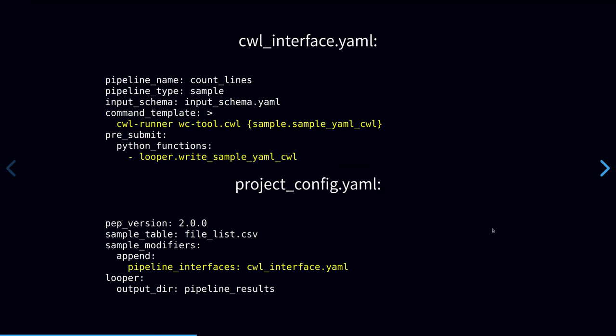To connect Looper to CWL, we simply specify the CWL runner command in a file called the interface file, where we describe the commands that we want Looper to run. Here we tell Looper to use CWL runner on each sample. And we also specify a pre-submission hook.